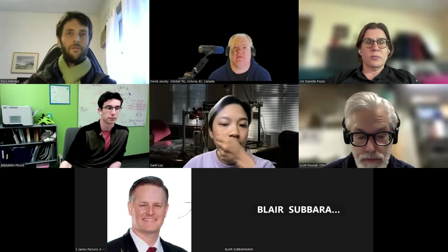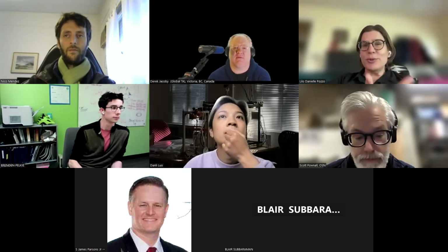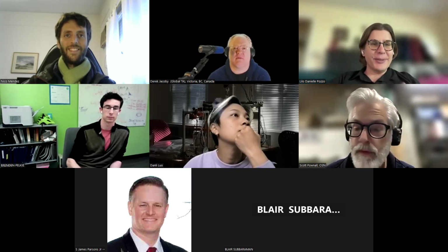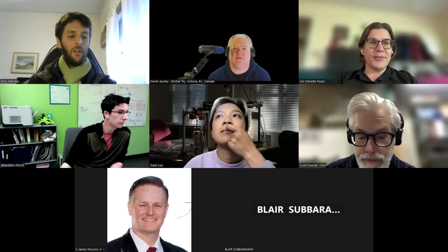Any other questions for Nico? I had one more question. So you have tool changing capability, but right now you're only pipetting. Have you thought about what's next, or what would you like your workflow to do next?